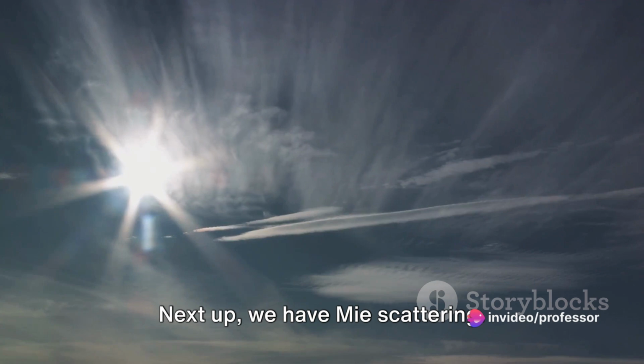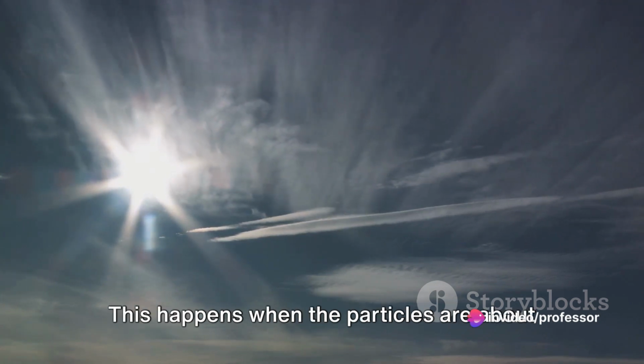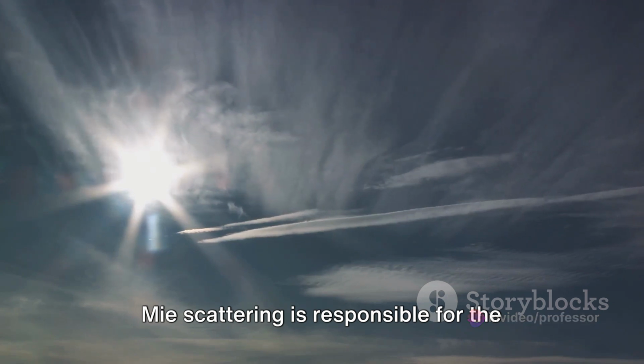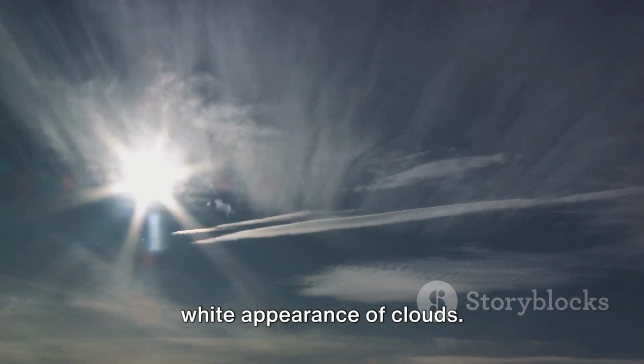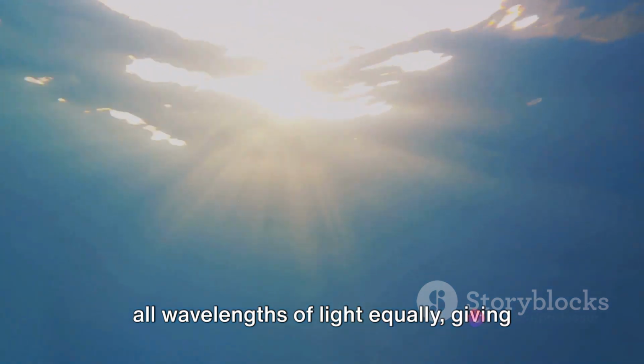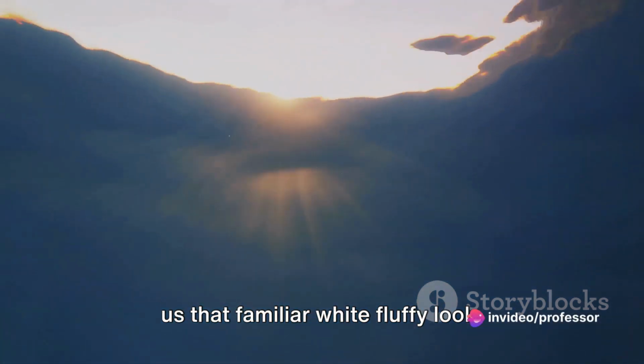Next up, we have Mie scattering. This happens when the particles are about the same size as the wavelength of light. Mie scattering is responsible for the white appearance of clouds. The water droplets in the clouds scatter all wavelengths of light equally, giving us that familiar white, fluffy look.